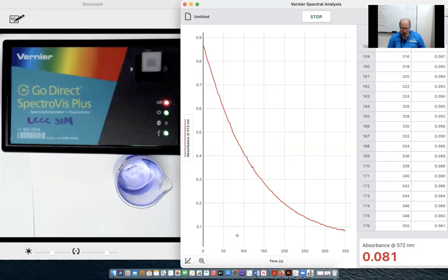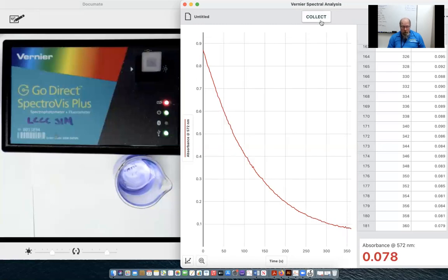So I'm almost at 360. I might as well go to 360, go 6 minutes. And let's stop our data collection on 360. There we go. So you now have your data for analysis.